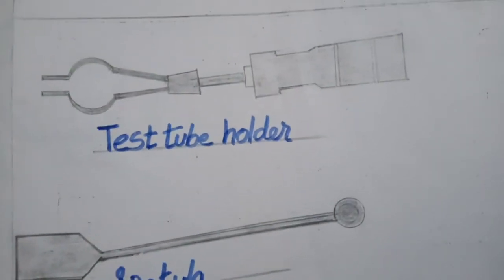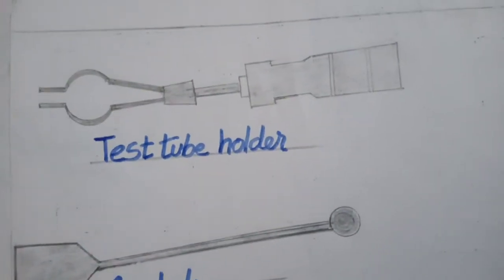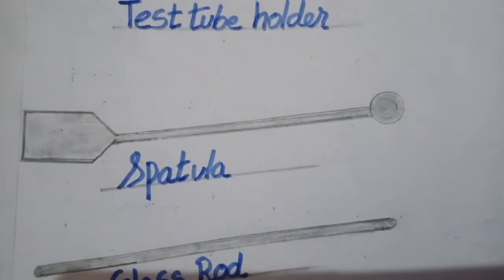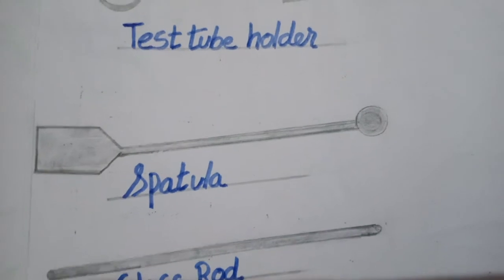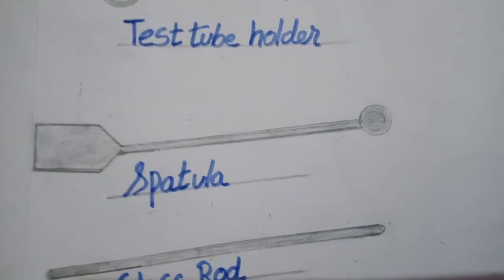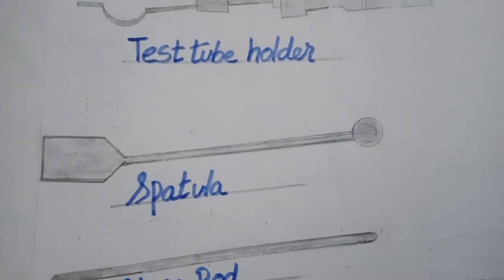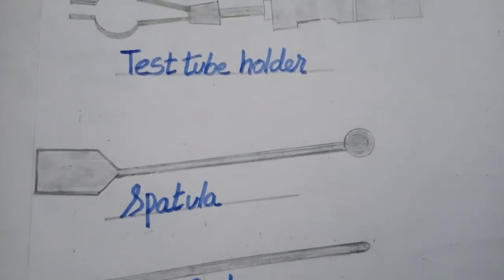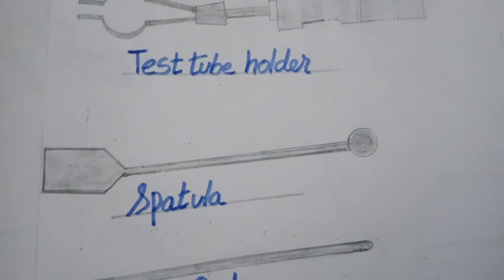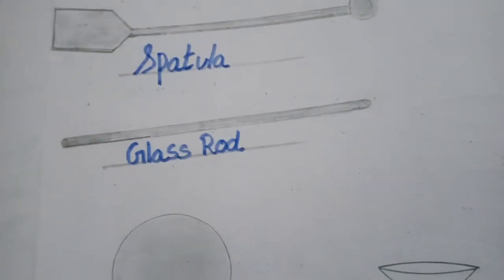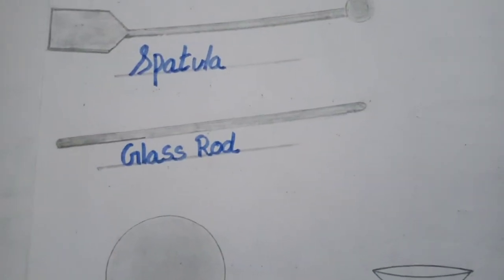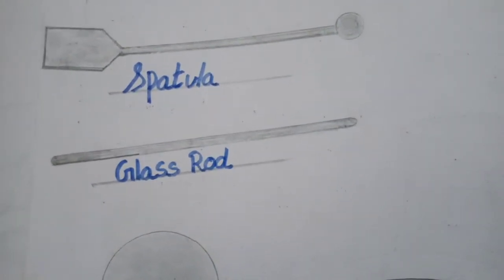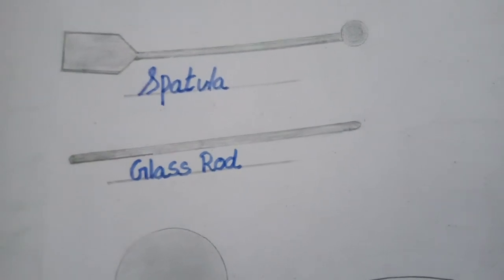Next one is a spatula. The spatula is used to put some salt and mix it in the test tube or beaker. Next one is a glass rod. This glass rod is used to mix the mixture of chemicals.